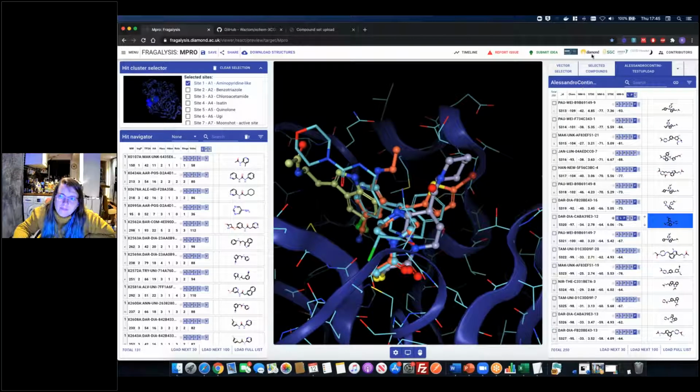Okay, there's a quick question here. What criteria do you use to choose the reference structure? Good question. So when we are aligning the things before they go into Fragalysis, we use the structure with the longest chain and the best resolution with the most correspondence to the most other structures. In Fragalysis itself, I believe it is randomly selected, which is a bit rubbish. We should probably use the same reference that we use to align to. Yeah.